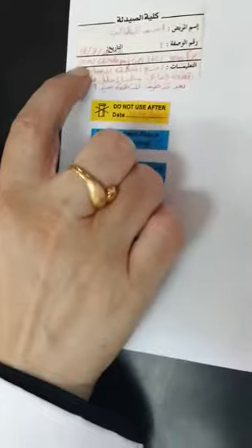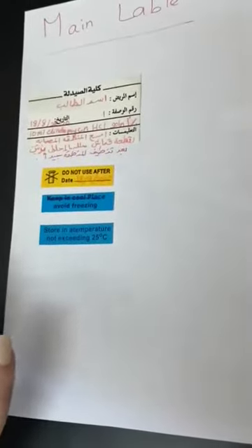18/8/2020. We have to add the name of the preparation, the amount, 10 ml of a solution, clindamycin hydrochloride. Solution is the dosage form, and the concentration, which is 1%. Instructions must be written in Arabic because we are living in an Arabic country. امسح المنطقة المصابة بقطعة قماش مبللة بالمحلول 2 يوميا بعد تنظيف المنطقة جيدا. And we have to explain all that in counseling for the patient.